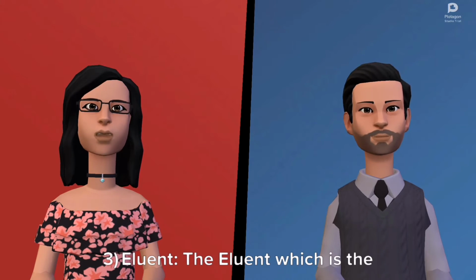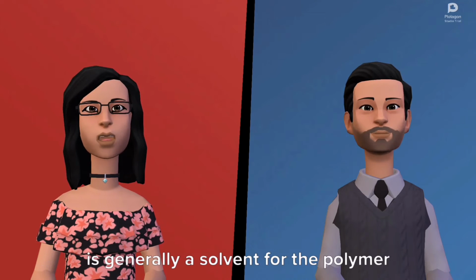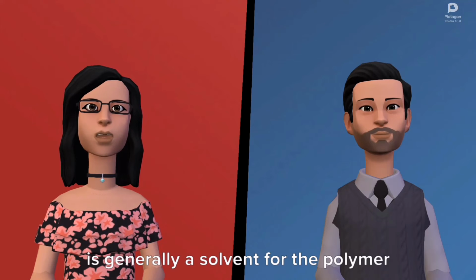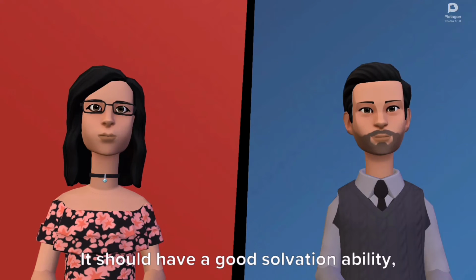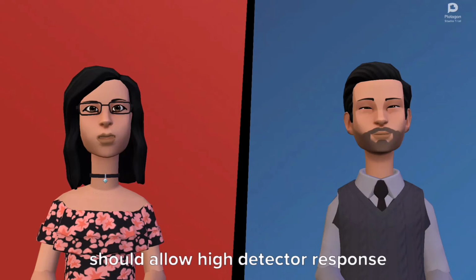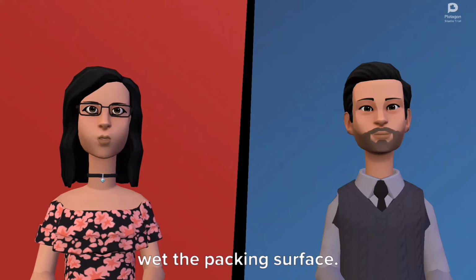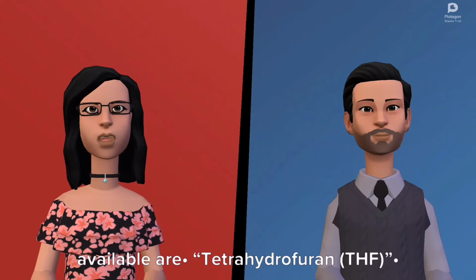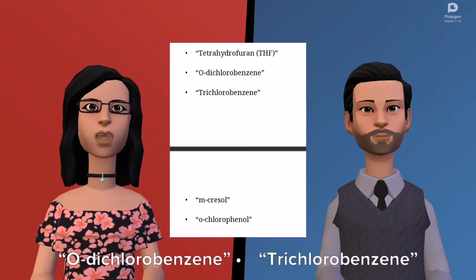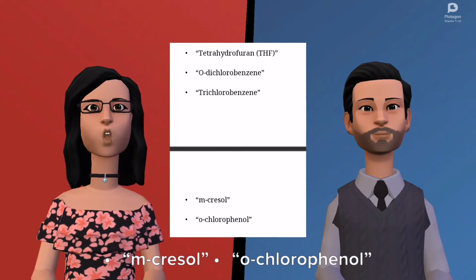3. Eluent. The eluent, which is the mobile phase of gel permeation chromatography, is generally a solvent for the polymer whose analysis is to be performed. It should have a good solvation ability, should allow high detector response coming from the polymer, and should wet the packing surface. Some of the most common eluents widely available are tetrahydrofuran, THF, o-dichlorobenzene, trichlorobenzene, m-cresol, o-chlorophenol.